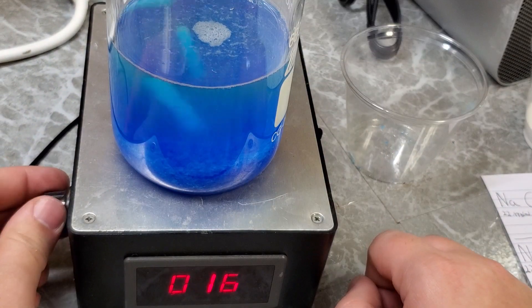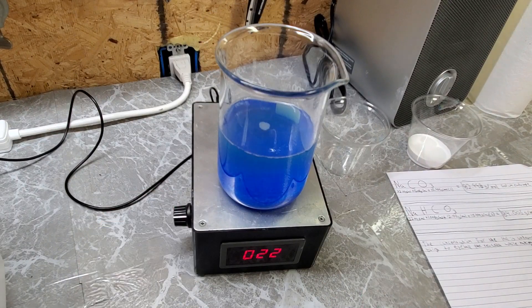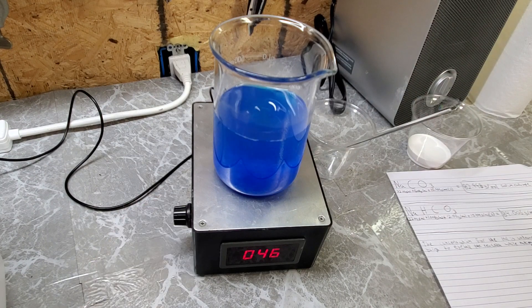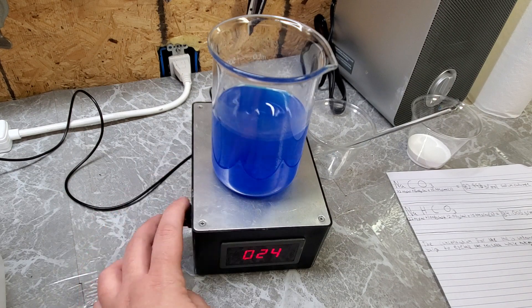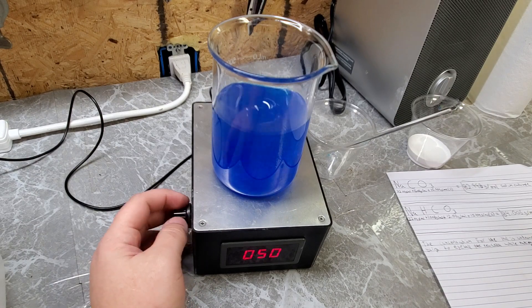First, we dissolve some copper sulfate, which was purchased as root killer, in an arbitrary amount of distilled water. Since we're doing this the quick way and using impure hardware store chemicals, we're going to use visual indications during the reaction instead of worrying about stoichiometry. Copper sulfate is incredibly soluble in water; however, it dissociates slowly into solution. So even though it may take a while, up to 32 grams of copper sulfate pentahydrate will dissolve in 100 milliliters of water.